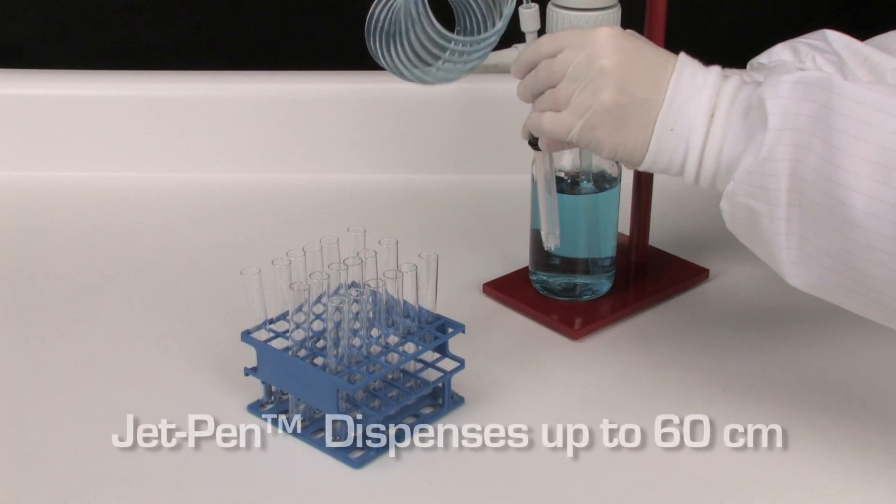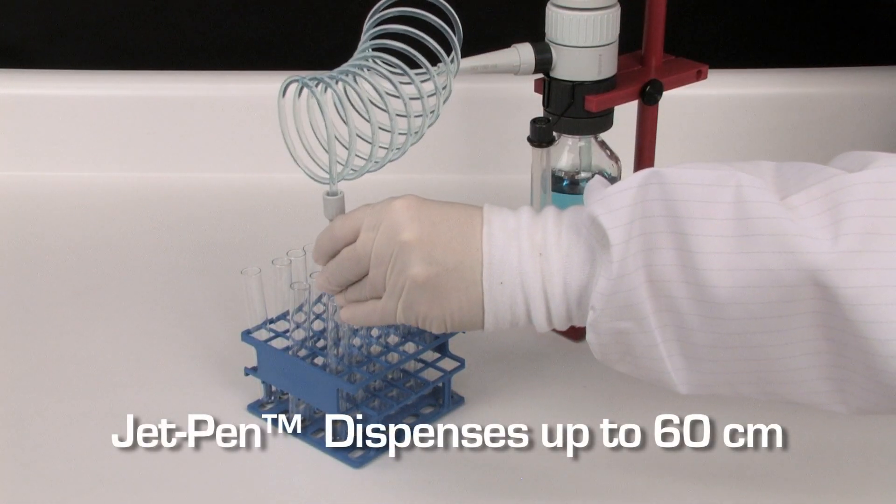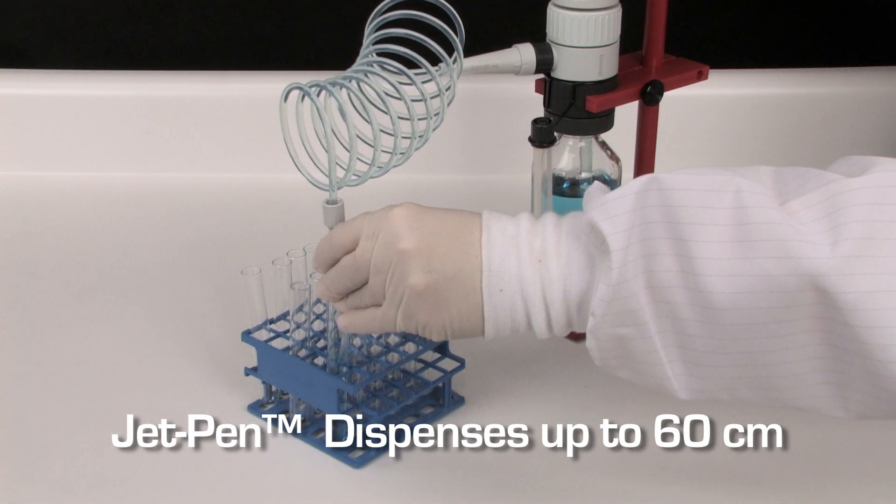Spiral tubing and the delivery Jet-Pen help dispense material into vessels with maximum comfort within a 60 centimeter distance.